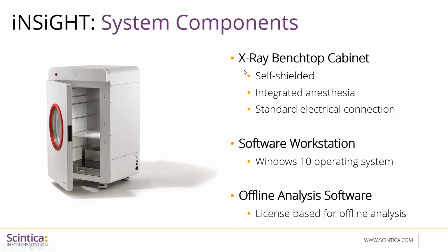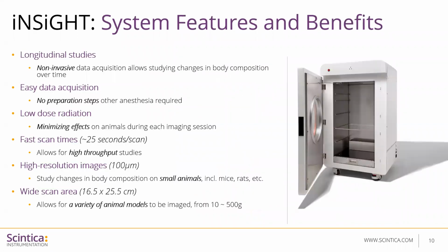The cabinet itself is self-shielded, so you don't need any other infrastructure to site the instrument, and so users simply close the door and it's safe to operate. As I mentioned, there is integrated anesthesia if you choose to use isoflurane, and it does only require a standard electrical connection. The software itself, as you'll see when I share it, operates on a Windows 10 operating platform, and there is an offline analysis package available for you to do the analysis on the images outside of the lab, not taking up time on the system to do the analysis and allowing you to sit at your desk or at home to do the analysis if you choose to.